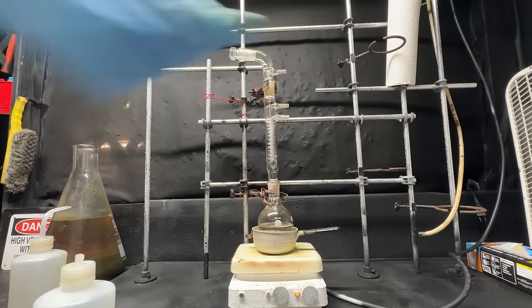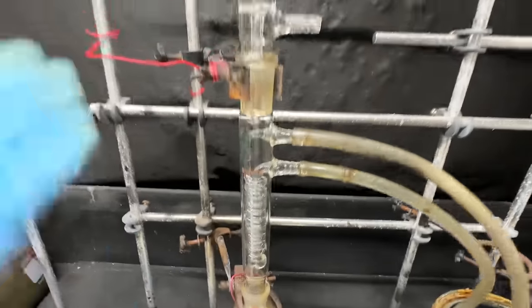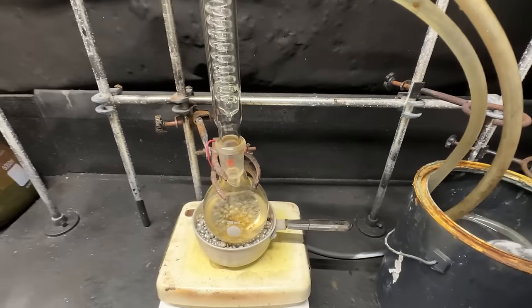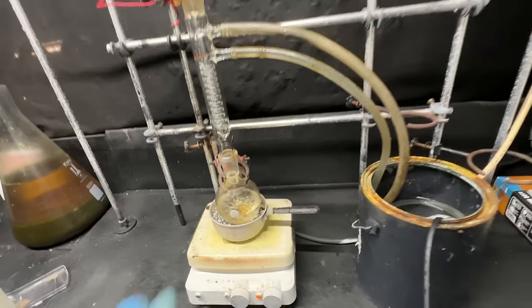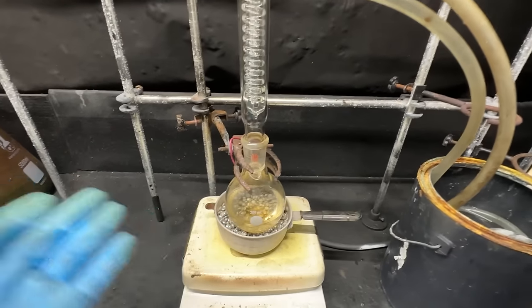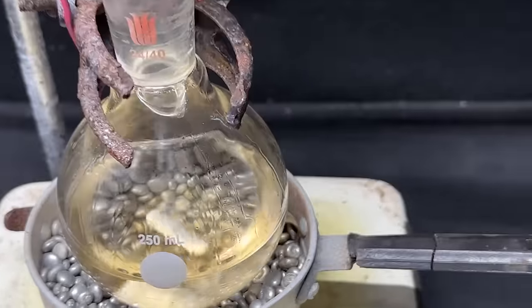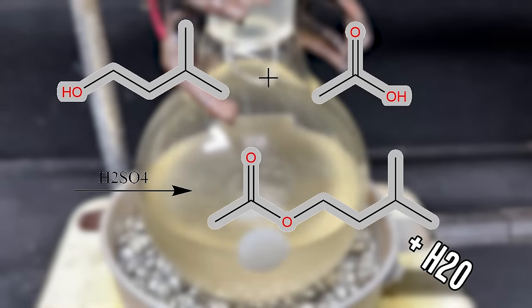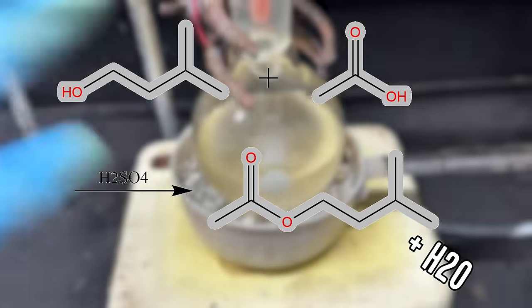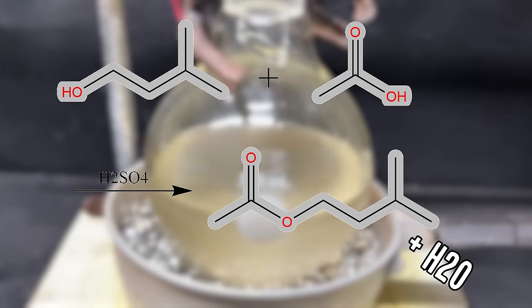I need to add some water here so we can cool our condenser. Okay, water is flowing through. I've got gentle heating on and now we're just going to let this reflux. As it refluxes it will form our isoamyl acetate — our bee attack pheromone — and it'll smell like bananas. We've got our stir bar going and we'll let this reflux for about an hour. We're about 20 minutes in and finally starting to get a reflux, so about 40 more minutes to go.